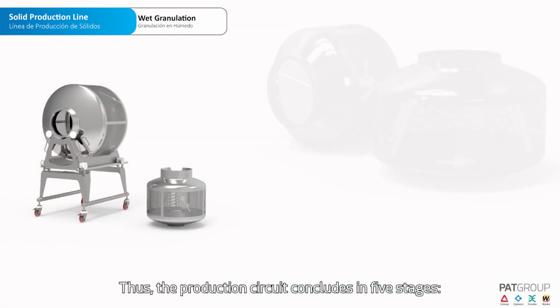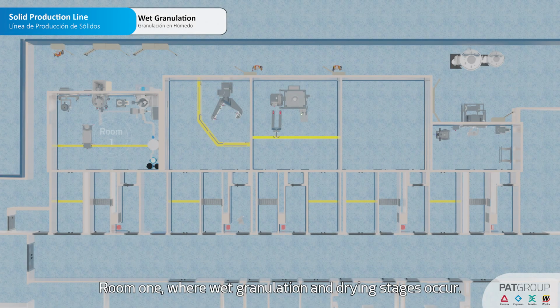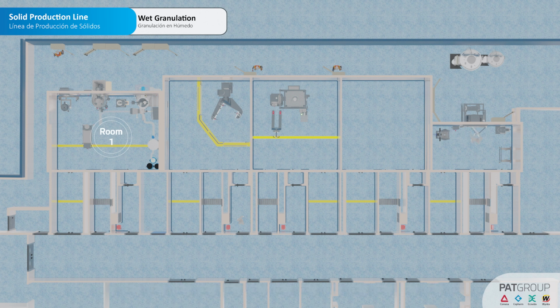Thus, the production circuit concludes in 5 stages. Room 1, where wet granulation and drying stages occur. Room 2, for granule lubrication. Room 3, the compression room. Room 4, the coating room.